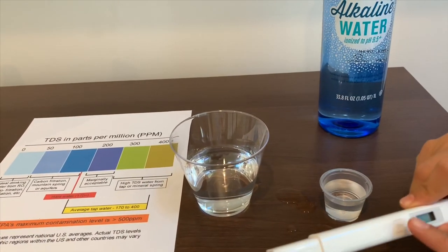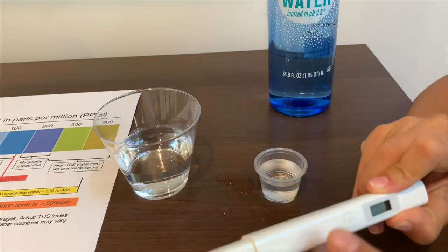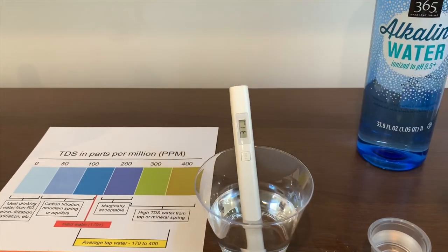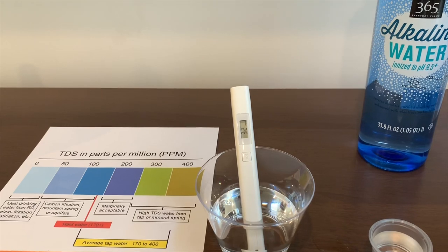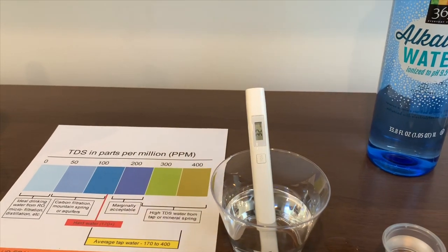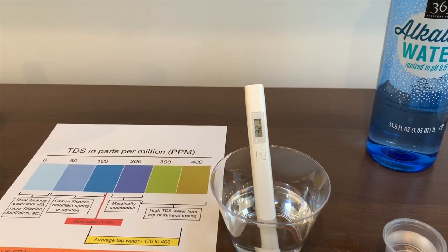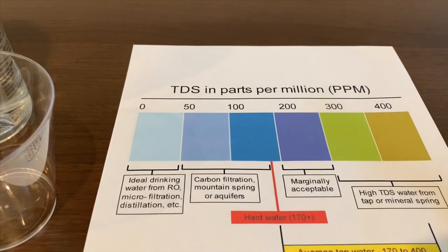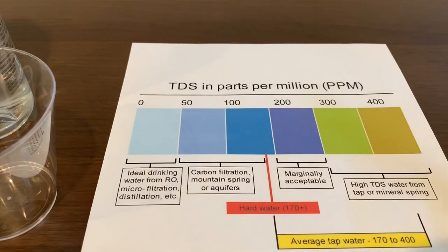Now let's turn on the TDS. Make sure it says zero. Put it in — it says 32. It is ionized drinking water.